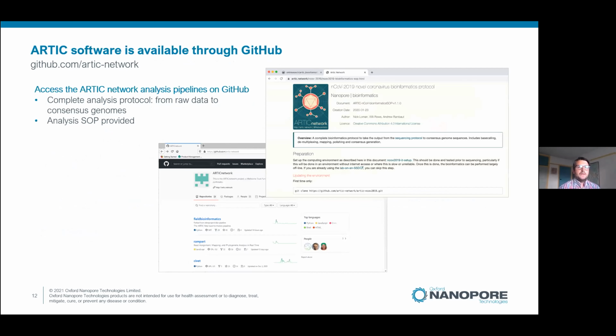So they'd also gone as far as providing a bioinformatic answer to the data that had been produced from these things, and that's freely available on GitHub. It's very comprehensive. It's called Rampart, and they have a strong SOP that is provided alongside it as well.